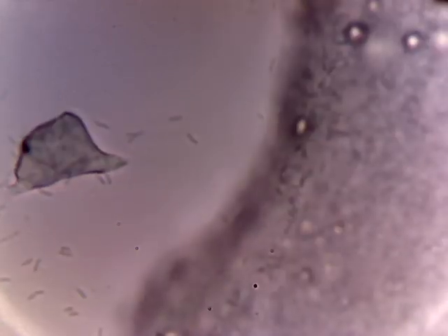You see, under the microscope at extreme power like this, the line of lard is very irregular. It's like looking at the Grand Canyon from the side. Anyway, there's quite a lot of them cruising that whole edge. I really think it's got something to do with food. You'll notice they're close to the center, just right of center.